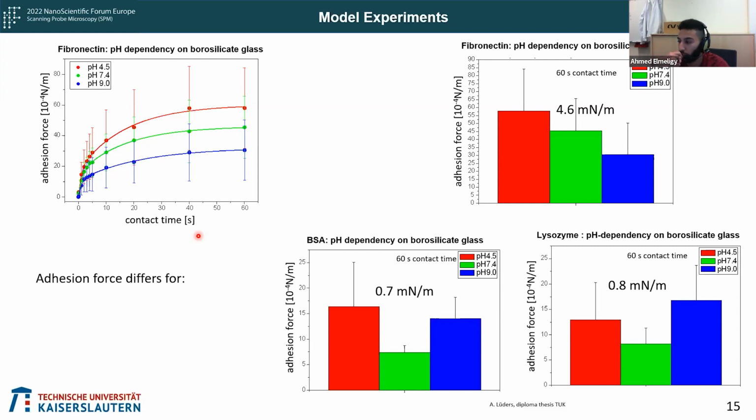And to wrap up what's most important for this project: we're investigating how the change of protein is going to affect our adhesion force, how the contact time is going to change our force curves, and the effect of pH and ionic strength.